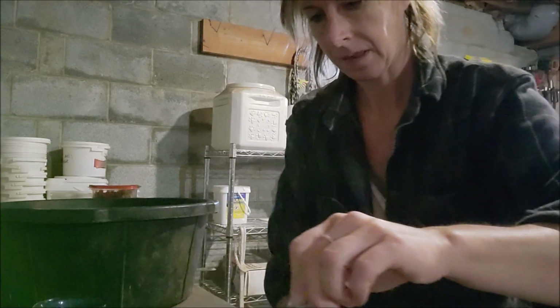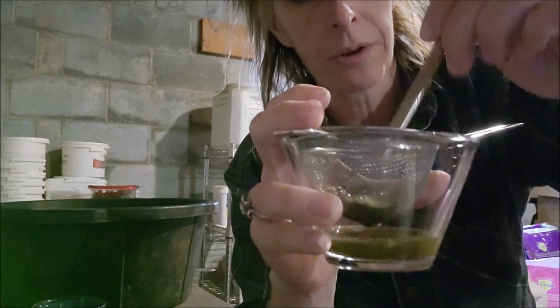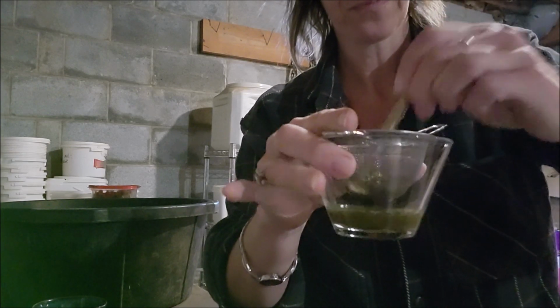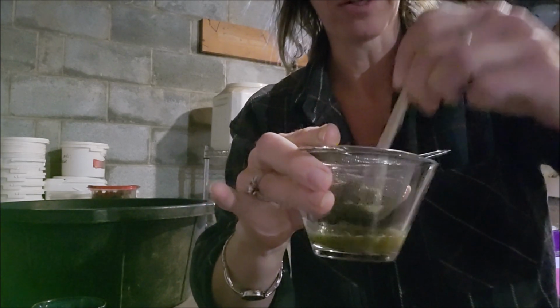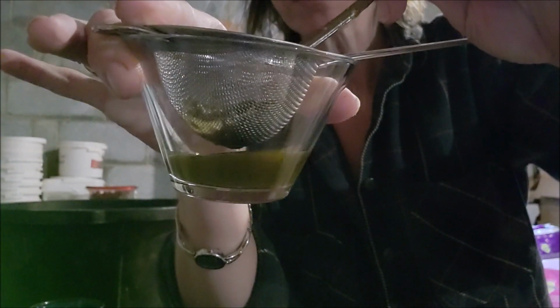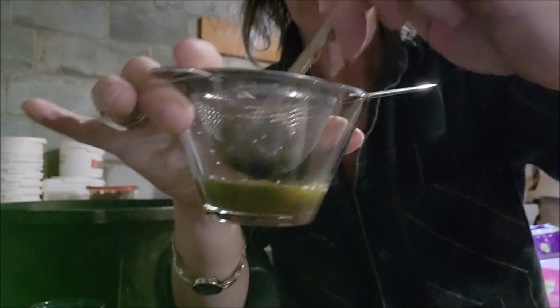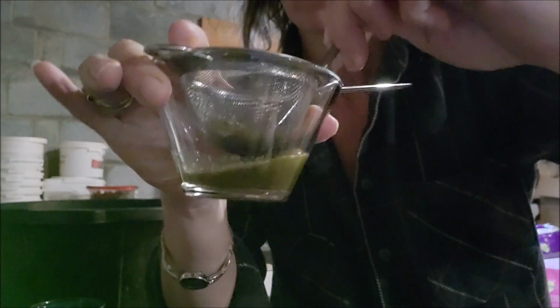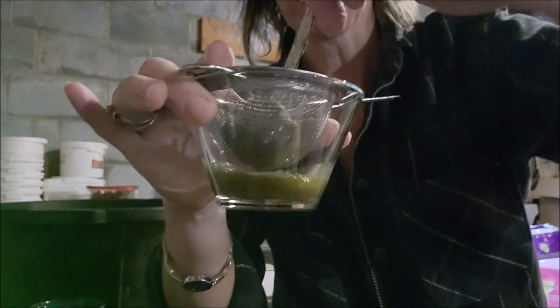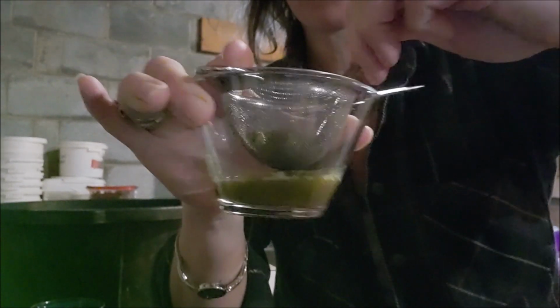All right, so now it's all in here. And basically what we want to do is squish all the water out. So what we have left here is at the bottom. So we're just going to strain this all out. See if I can do this without, there we go. So you want to let it go around and kind of mix it around, and you'll have a fecal ball start to form in here. So as you squish it down, you can see it dripping. We want to get this fecal ball that's in the tea strainer as dry as possible. So that way we know that we have as much eggs as we can get. And that's very, very important. So as you do that, it looks really kind of gross, huh? Almost like green. All right.